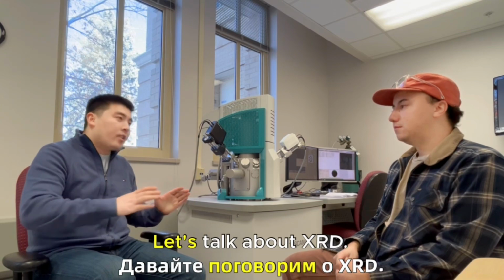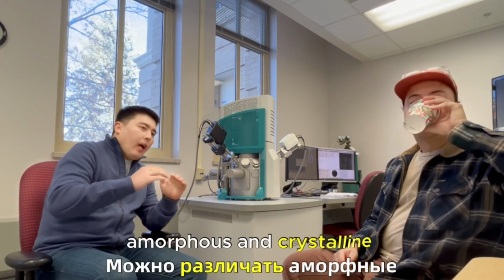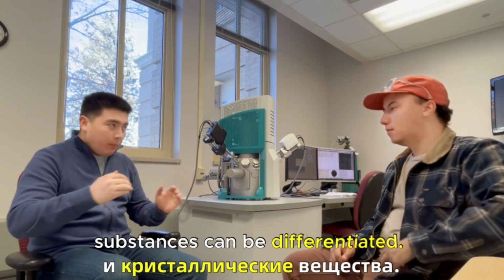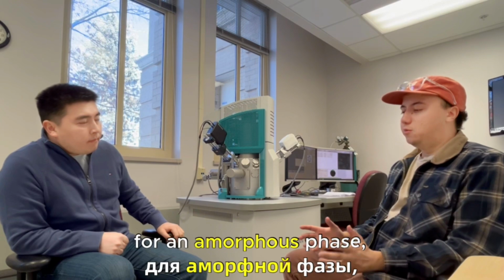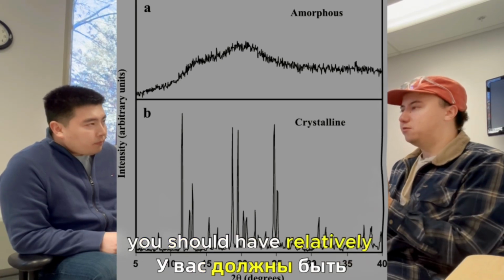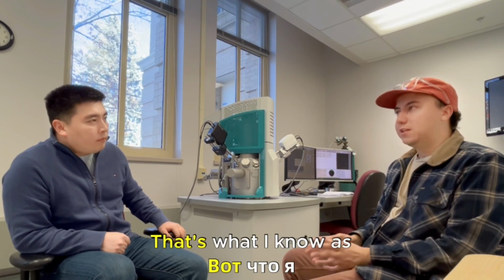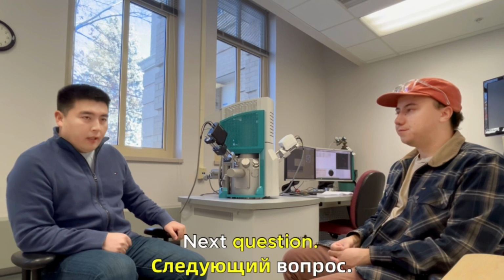Let's talk about XRD. In XRD, amorphous and crystalline substances can be differentiated. How can they be differentiated in XRD? Well, for an amorphous phase, you would expect to see a broad, round peak, whereas for crystalline phases, you should have relatively sharp peaks along your diffractogram. That's what I know as far as the differentiating factor. Yeah. Okay.